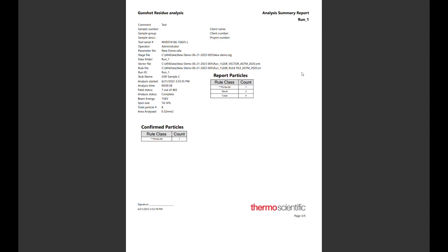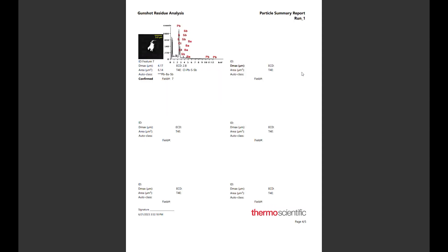Next is the GSR analysis summary report, which details the information of the run, including the length of the run, the number of particles identified, and how much of the stub was analyzed. Following this is the particle summary report, and this section displays the images and spectrums from the particles found during the run.